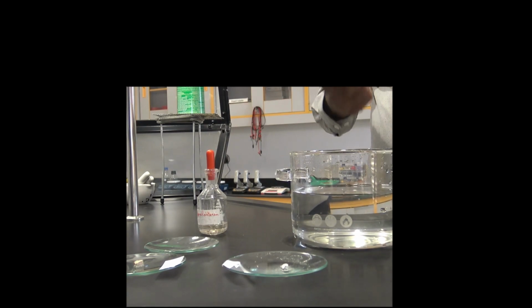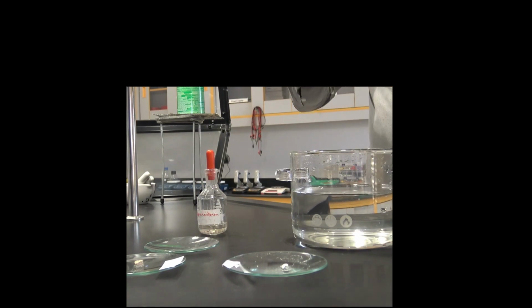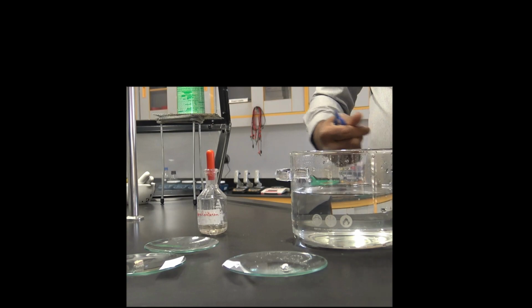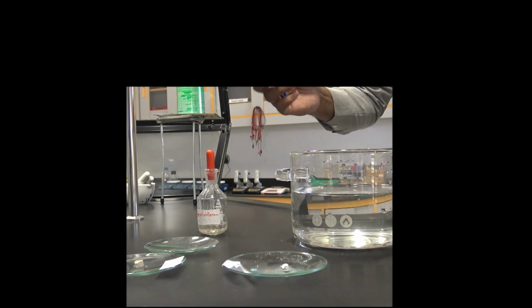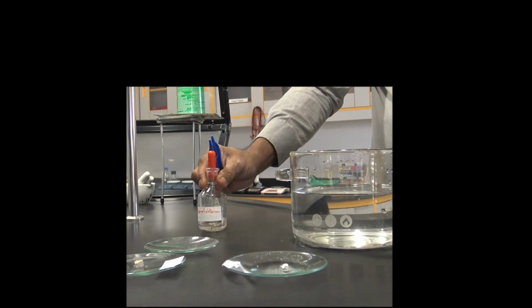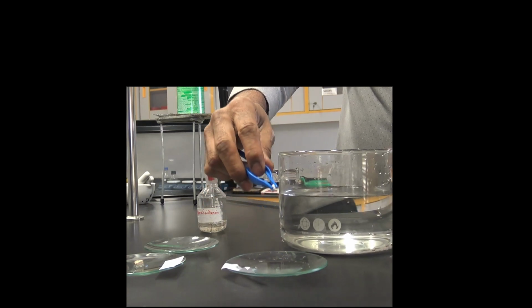So we have to be more careful while doing the experiment. Again, you have to be far away when the teacher is demonstrating this experiment. Make sure you have the goggles on, and sometimes we put a protective shield in front of the reaction, so if there's a splash, nobody is hurt. Again, I'm adding a few drops of phenolphthalein here, and notice the time of the reaction and how quickly potassium dissolves.